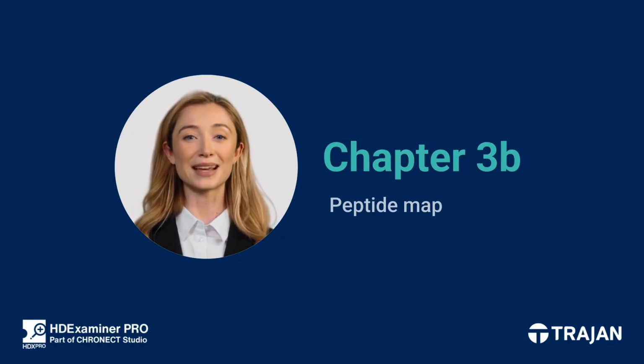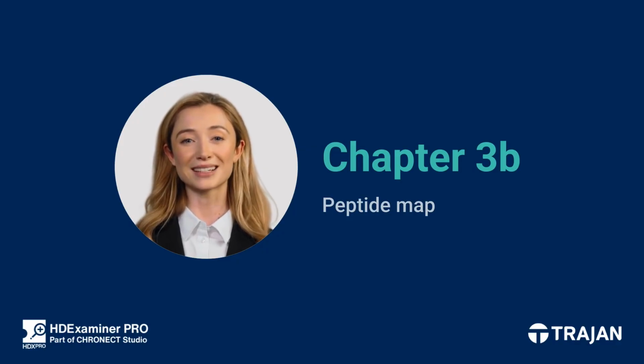Next up in Chapter 3b, we'll dive into the peptide map, a powerful visualization tool to help you see uptake differences across your protein sequence. Let's keep going.